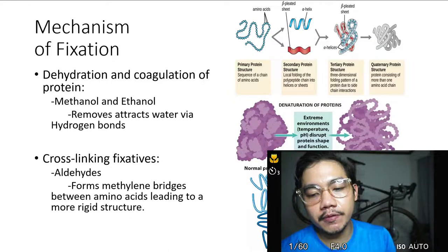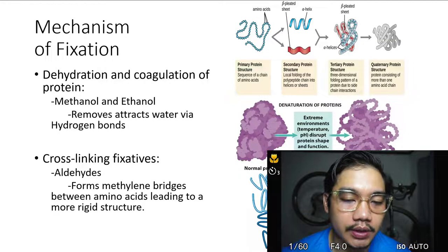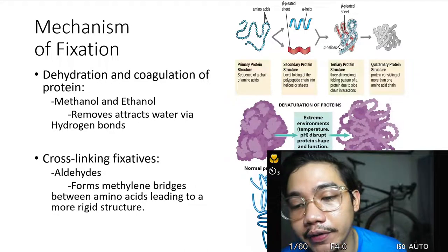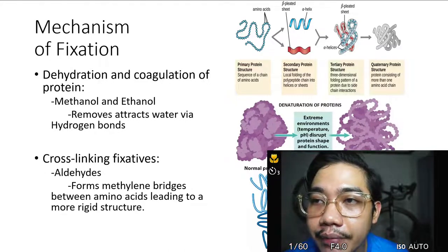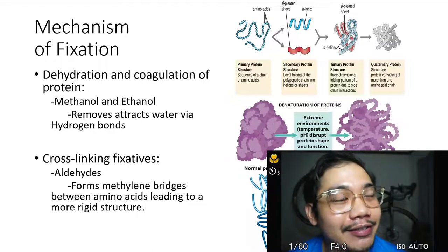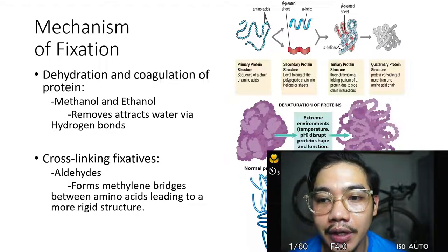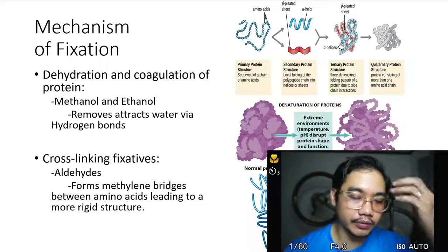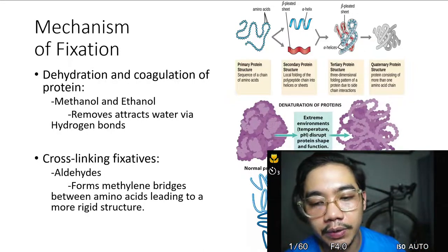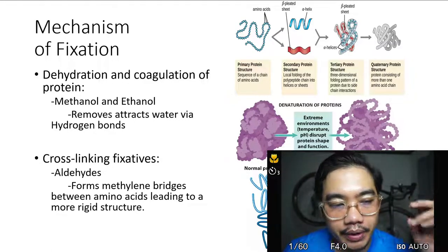So the mechanism of fixation. We have dehydration and coagulation of protein. Methanol and ethanol are alcohols. They have an OH group, and if you remember in your biochem, this OH group attracts water, right? They are quite hydrophilic, so they attract water.